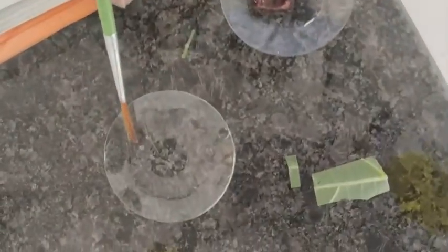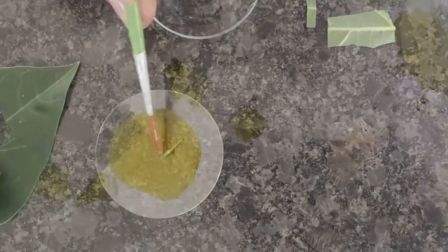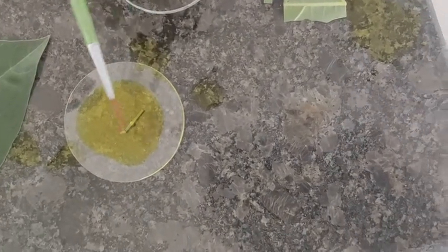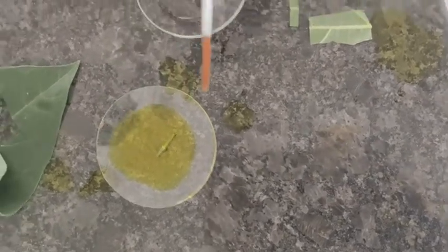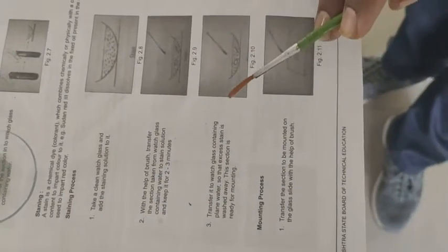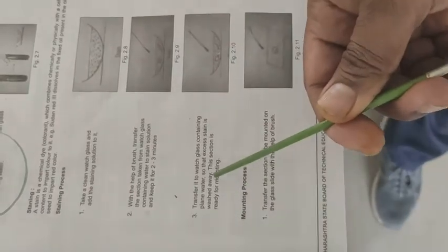We have to transfer this section with the help of a brush into the second watch glass containing the stain, and keep it there for 2 to 3 minutes. Then transfer it to a watch glass containing plain water so that excess stain is washed away.